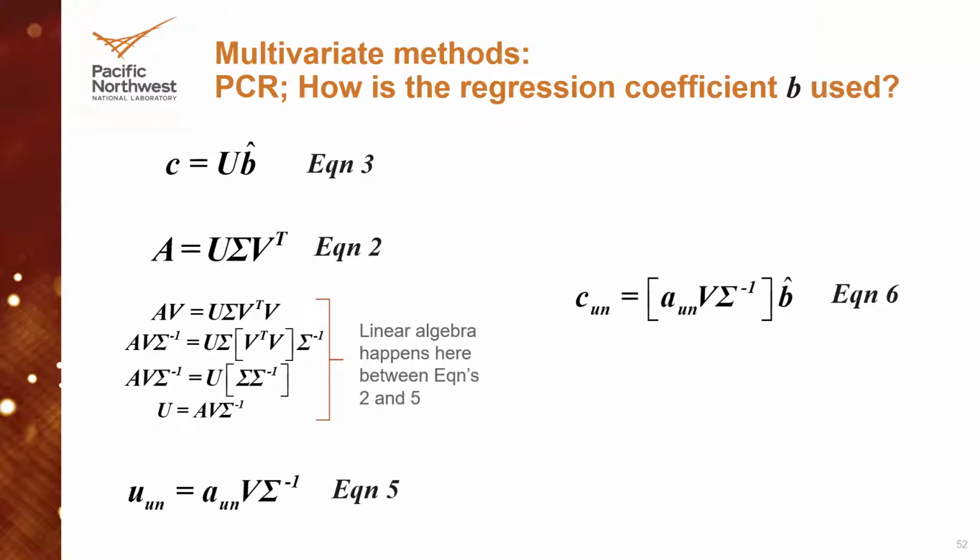Thanks. All right. And then another question about how robust the chemometric analysis is against the presence of impurities. So can you detect contaminants, and can you estimate the concentration of those contaminants with these methods and so on? So also a really good question. The robustness of your model is entirely dependent on how well you build it.